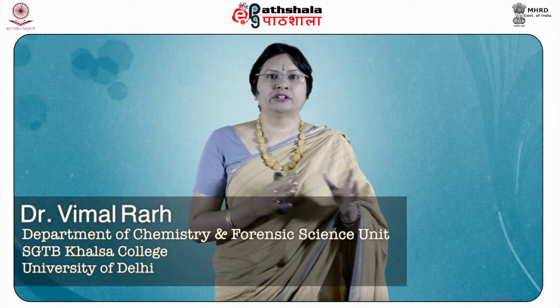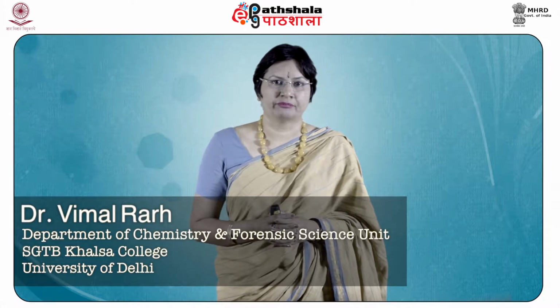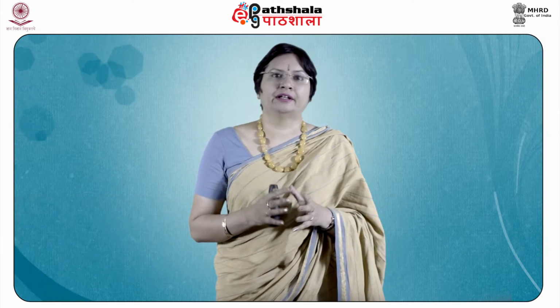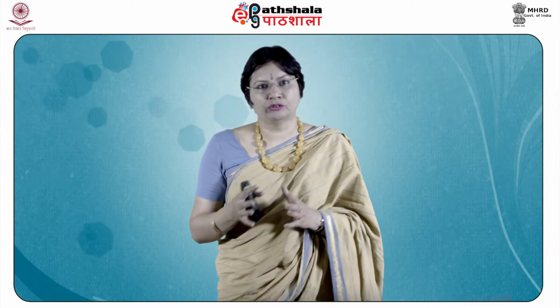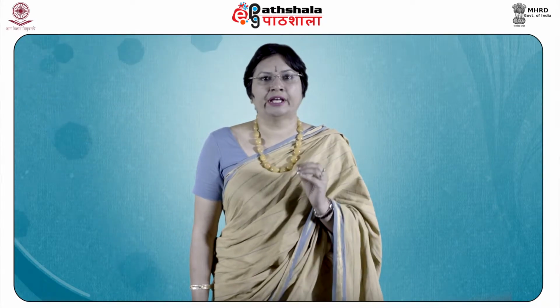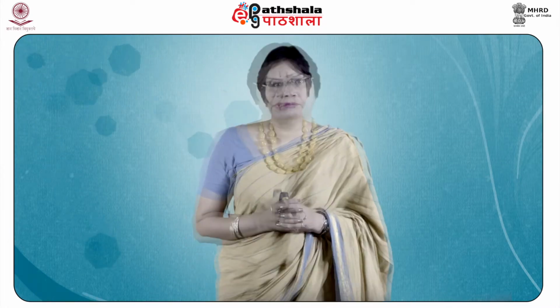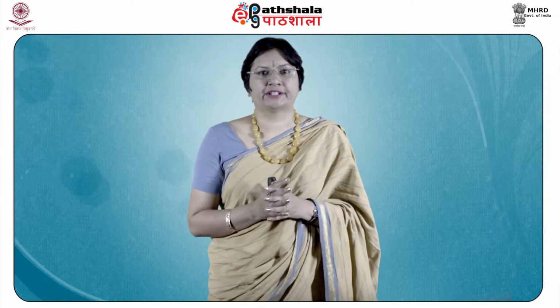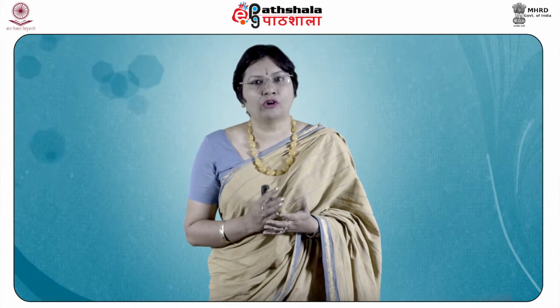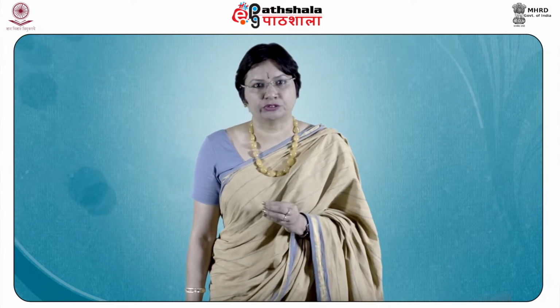You have studied what the various explosives are, their types, and how to manage the crime scene. But when you take this evidence of bombs and other explosive material into the forensic lab, how do you deal with the inorganic anions and cations which are components of the evidence you have collected? So, this module shall focus on the analysis of inorganic anions and cations of the post blast residues.